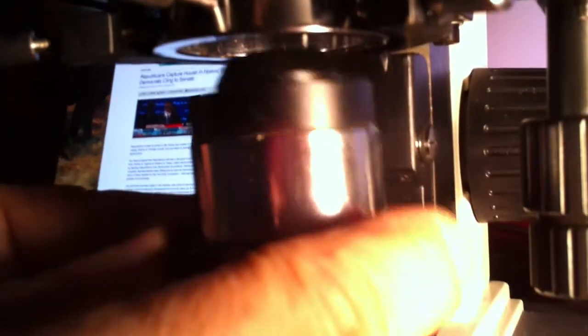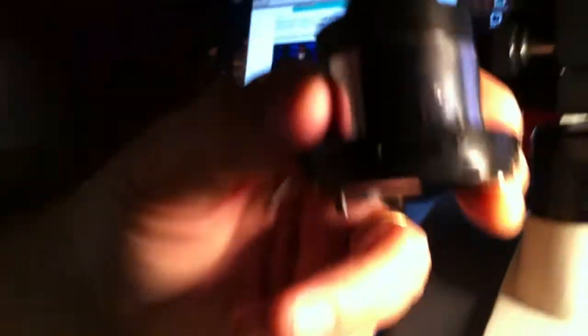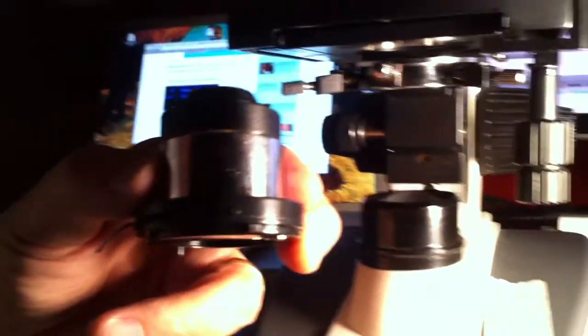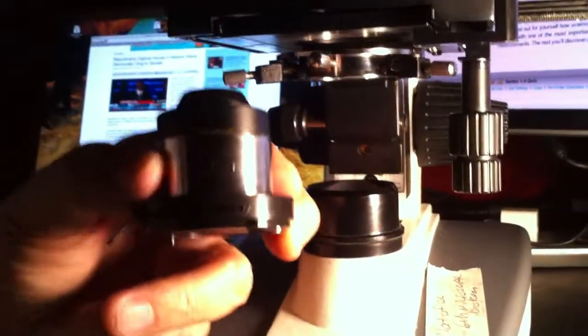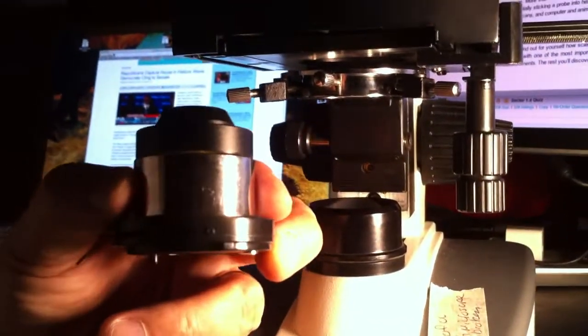If you turn it counterclockwise, it releases the sub-stage condenser from the ring assembly. And you can see I'm able to take it right out. That's the most likely way in which it could be removed.